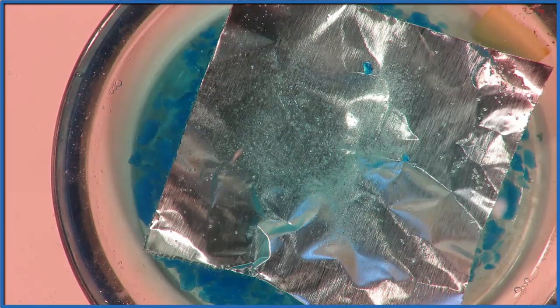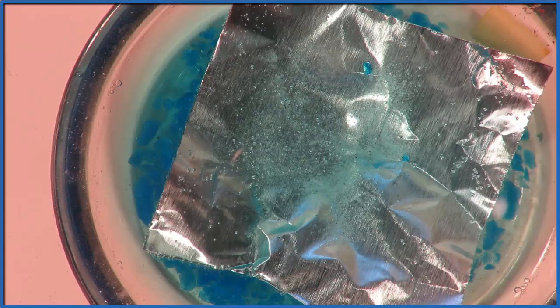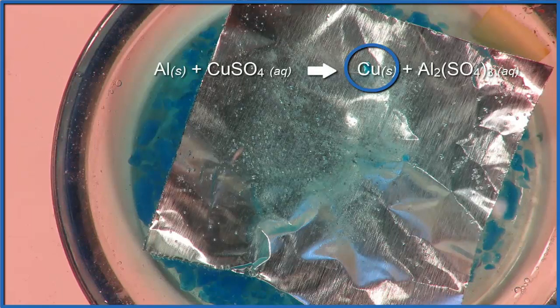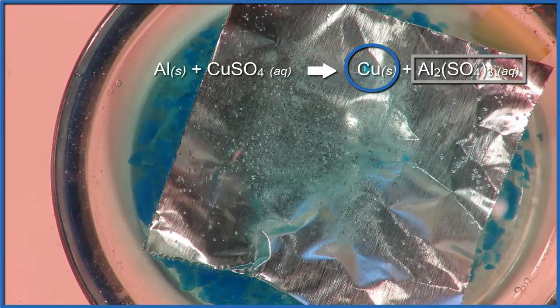This will go on for a while, and we should start to see some black dots, very dark areas — that's going to be the copper which is coming out of the liquid. It's dissolved in the liquid, so that copper will start forming on the aluminum, and the aluminum is dissolving and going into solution.